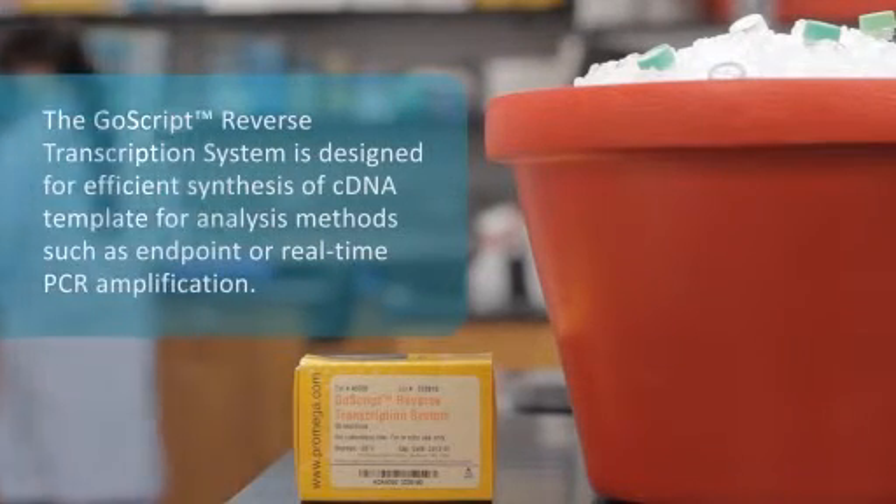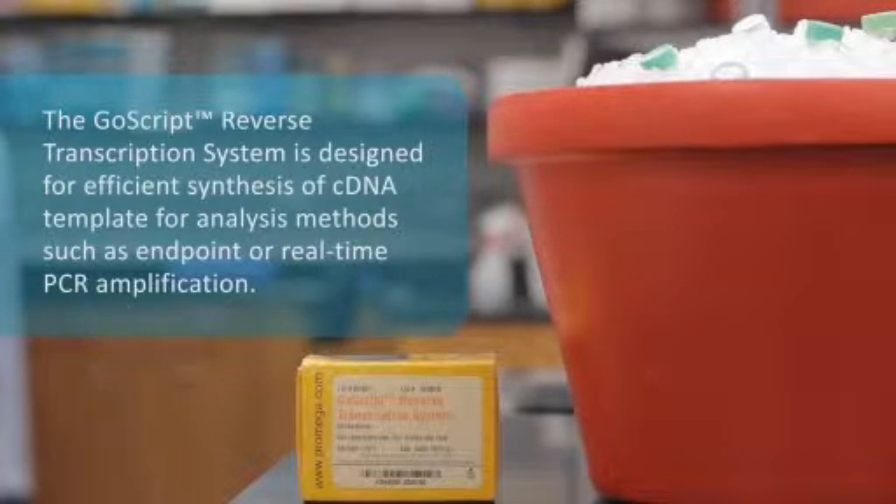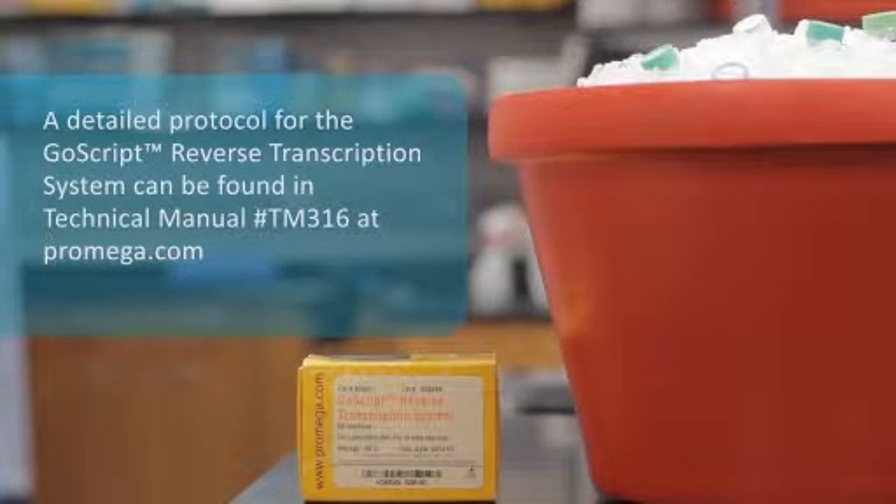The GoScript Reverse Transcription System is designed for synthesis of cDNA for analysis methods such as endpoint or real-time PCR amplification. A detailed protocol for the GoScript Reverse Transcription System can be found in Technical Manual TM316 at promega.com.